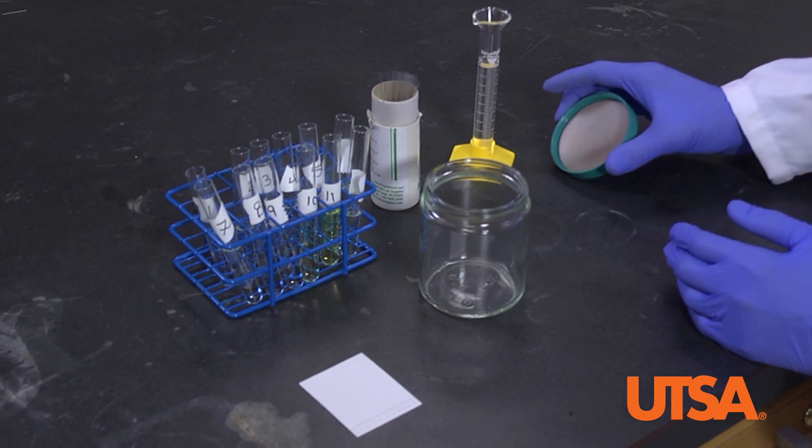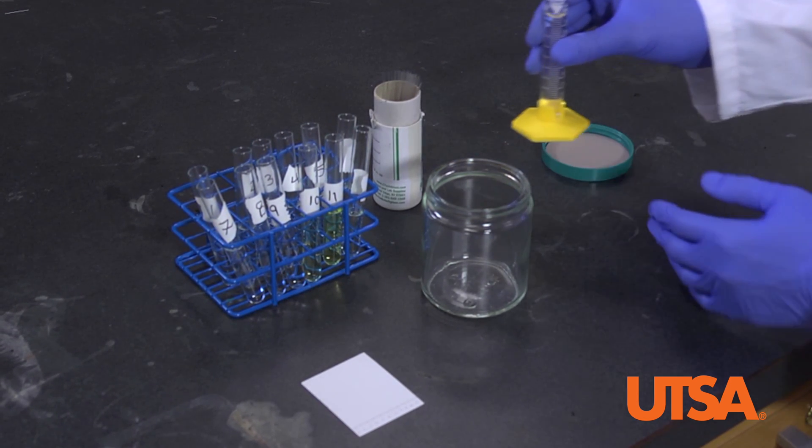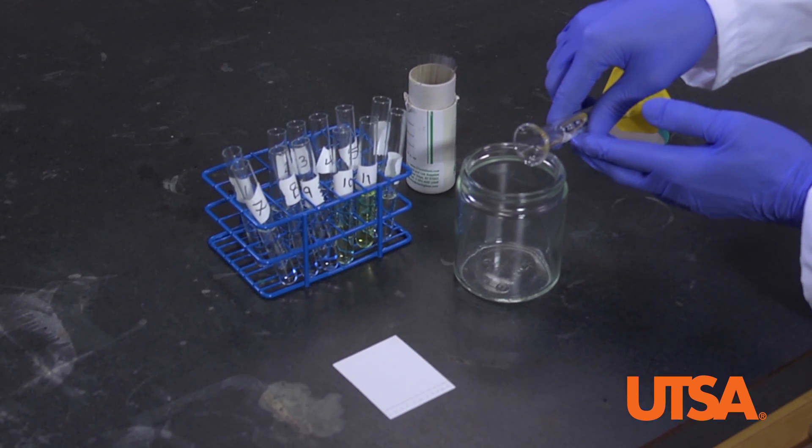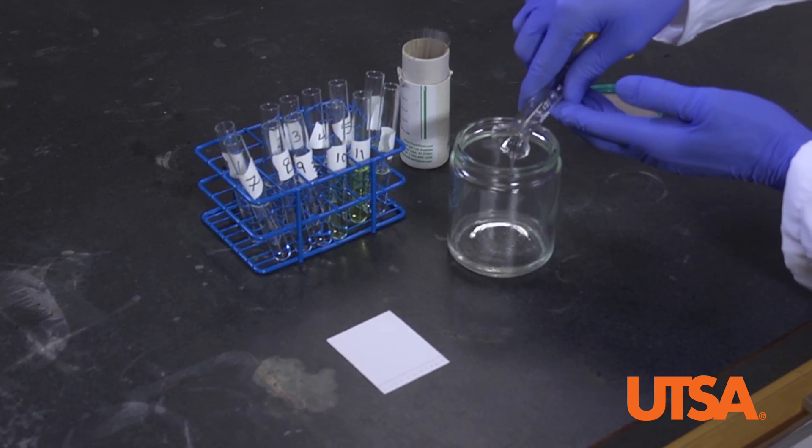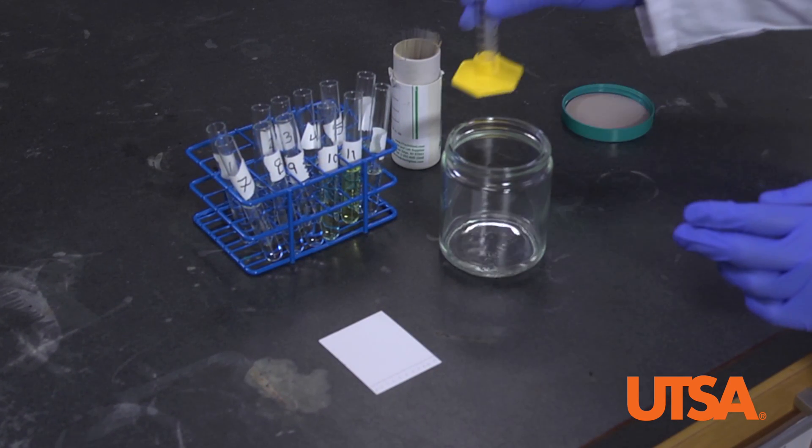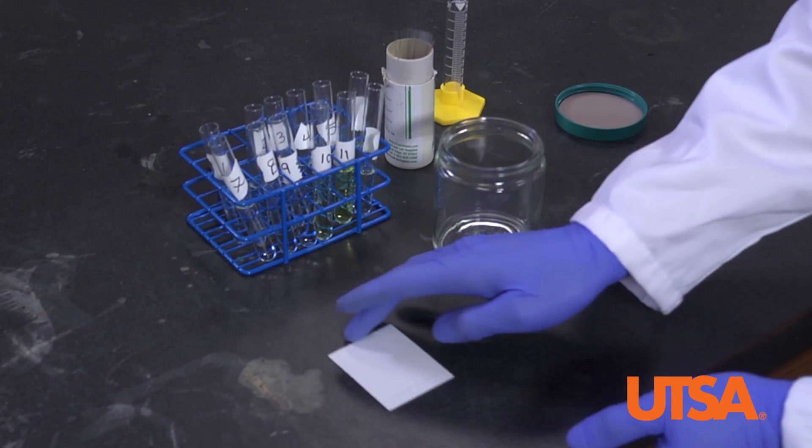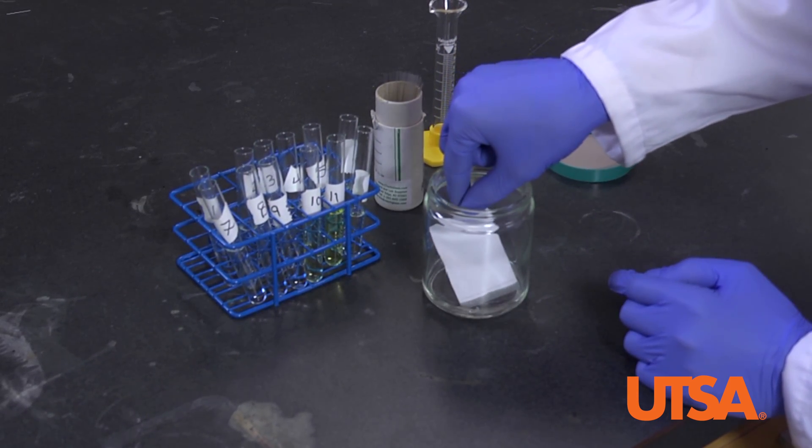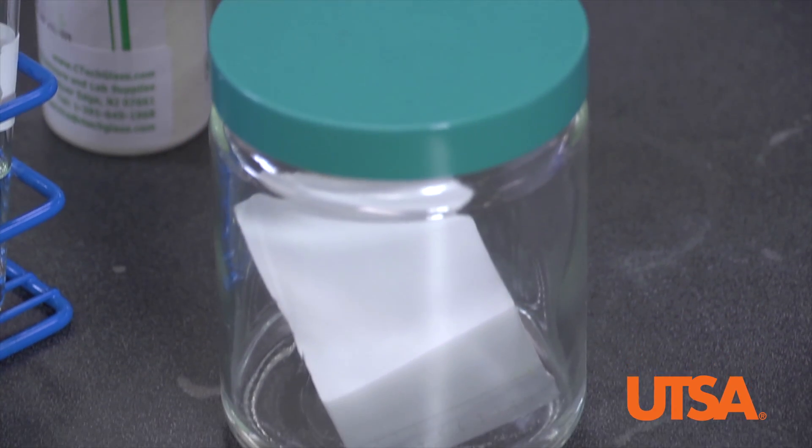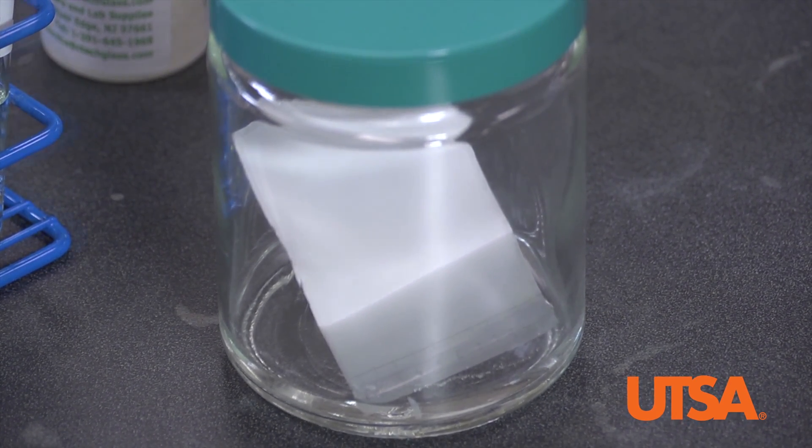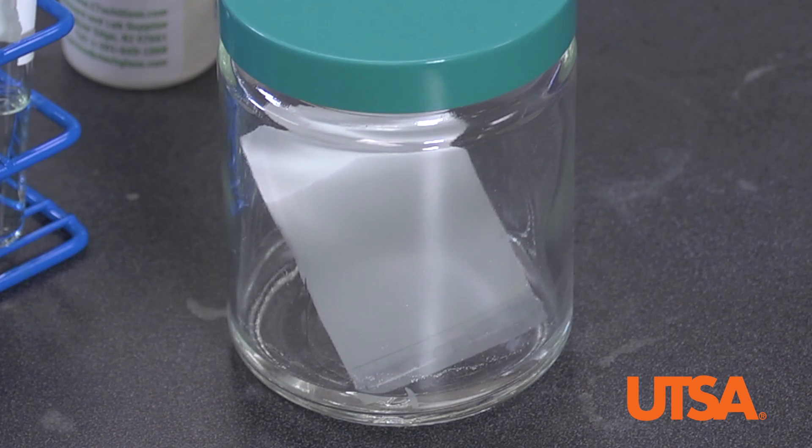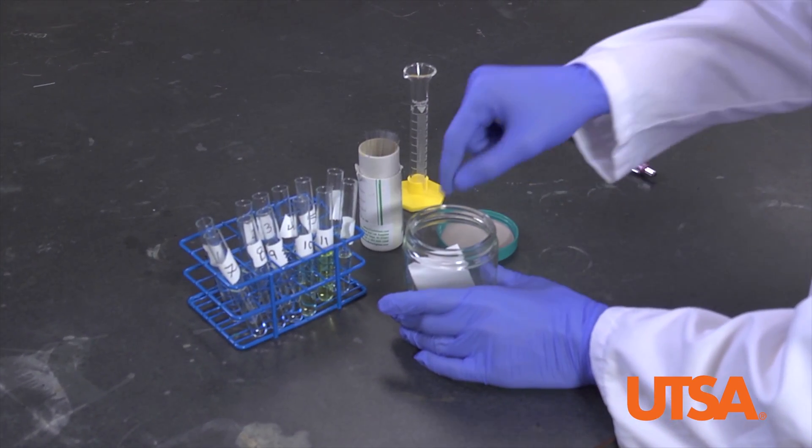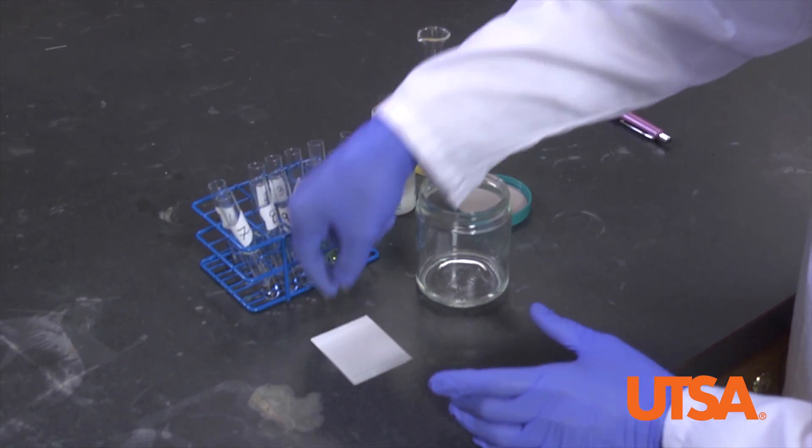Add the TLC plate to the developing chamber. Pour 10 milliliters of 15% DCM in petroleum ether into the chamber. Add the plate and lean it against the back wall of the chamber. Add the lid. Watch as the DCM rises up the plate. And before the solvent reaches a centimeter from the opposite edge of the plate, remove it from the chamber and mark with a pencil how far it traveled.